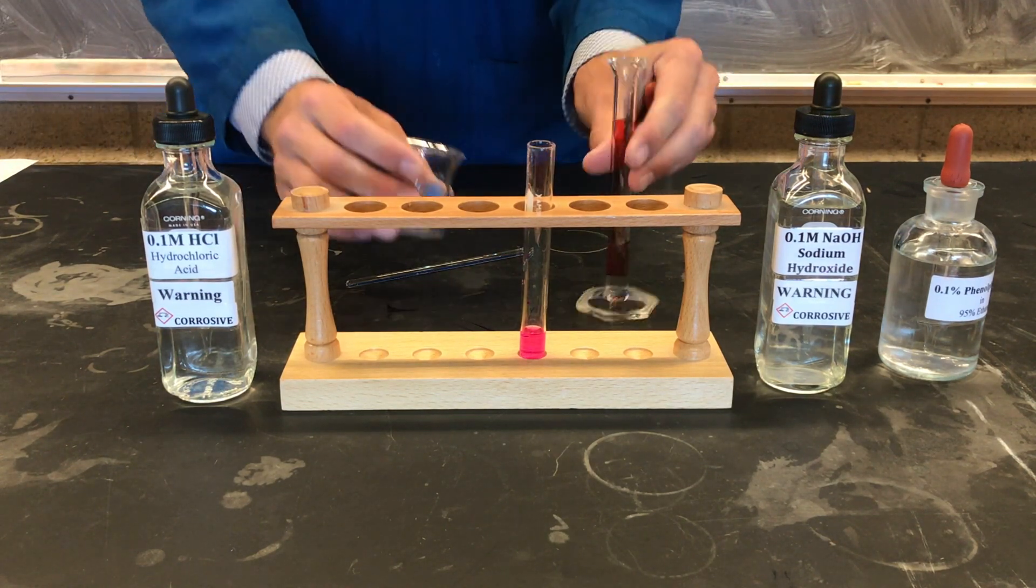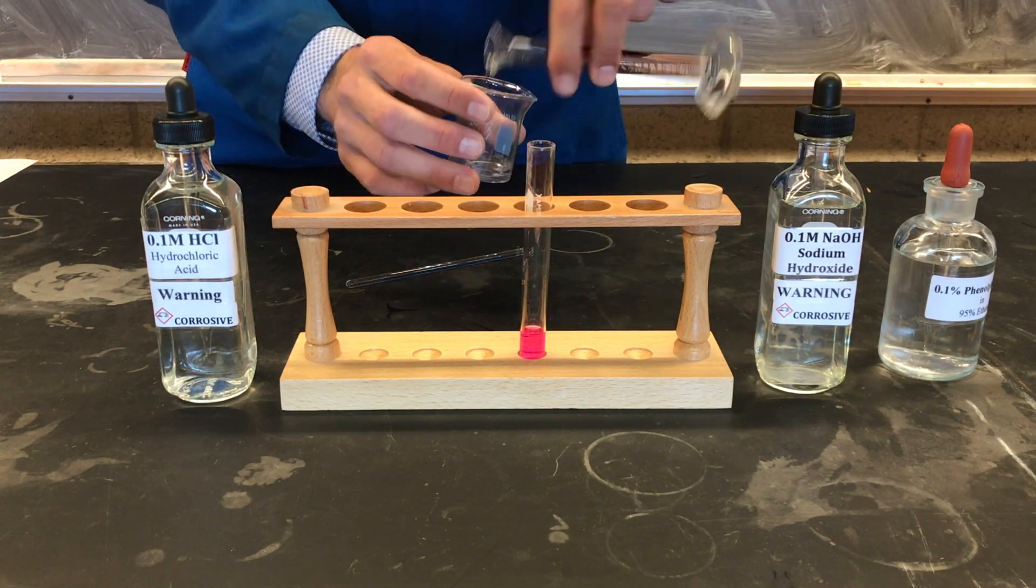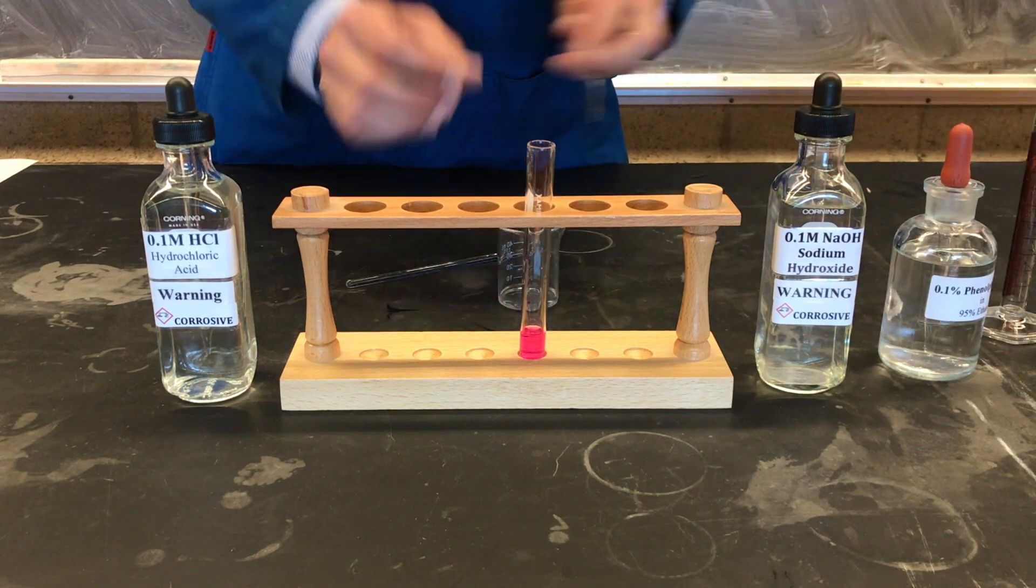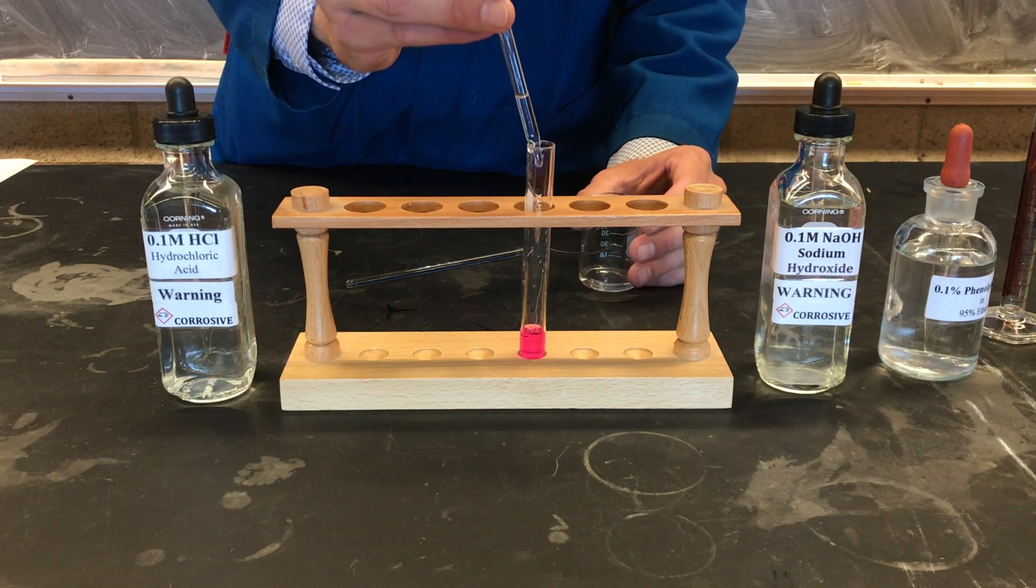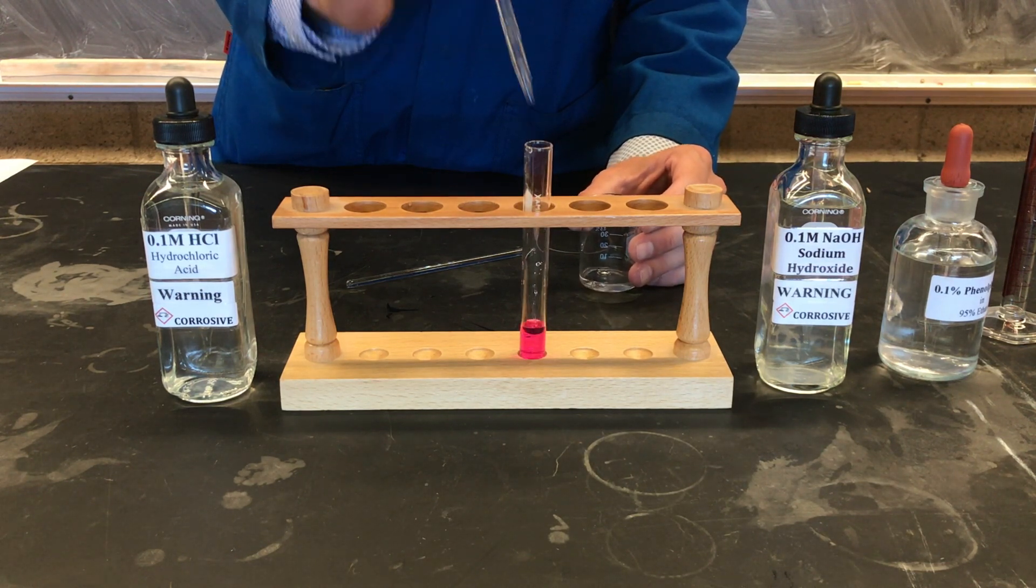Sometimes in experiments you have to adapt, so we'll transfer our solution to a 50 ml beaker and add then our hydrochloric acid solution to our test tube containing sodium hydroxide dropwise.